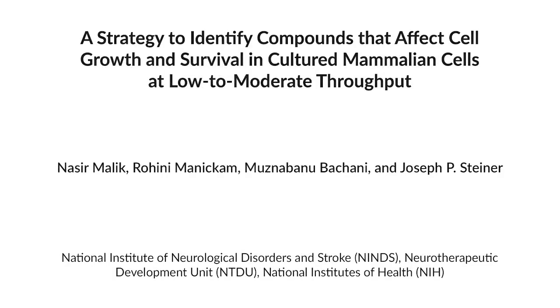This protocol offers a quick and efficient strategy to simultaneously use two assays to screen several hundred compounds for their effects on cell growth. The assays can provide us information of whether specific compounds are cytotoxic, inhibit cell growth, or enhance cell growth. By utilizing the two assays together, we are able to increase accuracy and identify cytotoxic compounds.